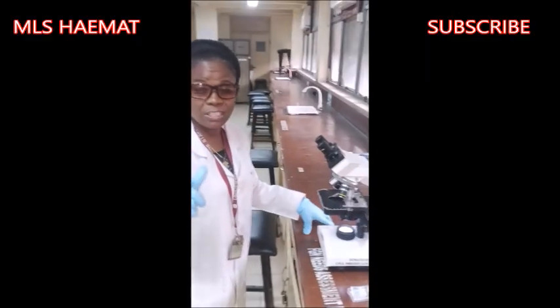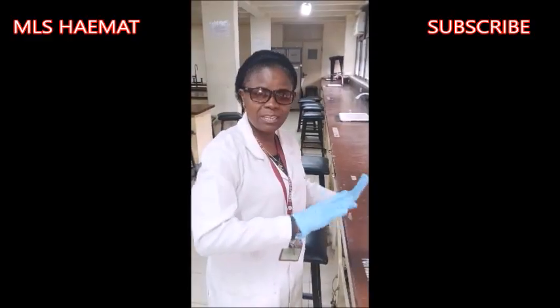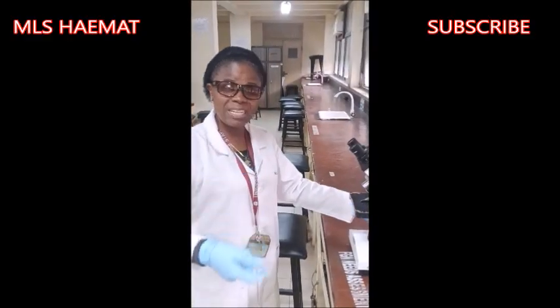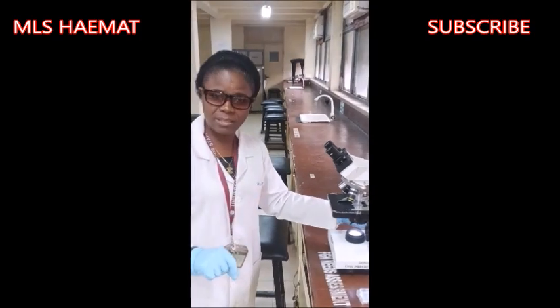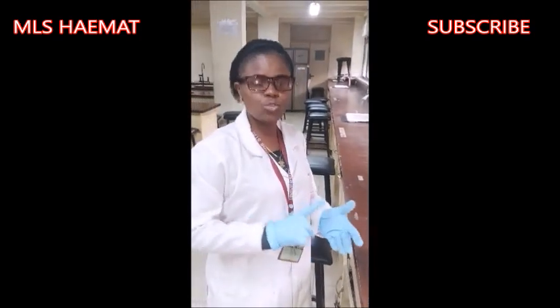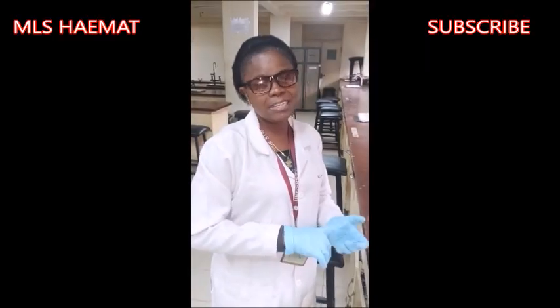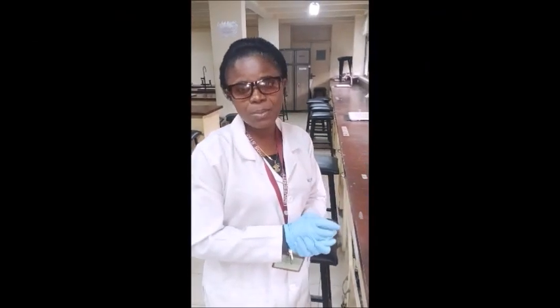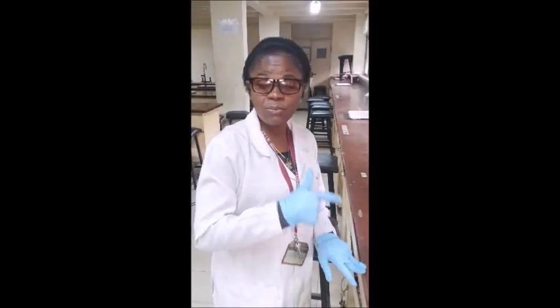But you also need to know the condenser should be wrapped down. When you are viewing anything with a times 10 objective and times 40 objective, ensure that the condenser is lowered so that you reduce the amount of light, because you don't need much light to view with the low power and the high power objective lens. So that is all about the focusing of wet preparation.